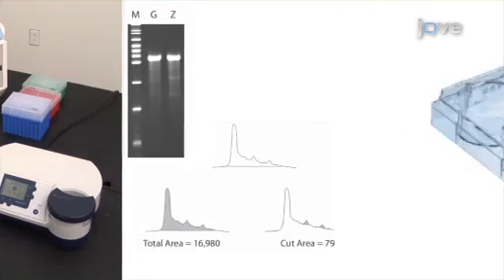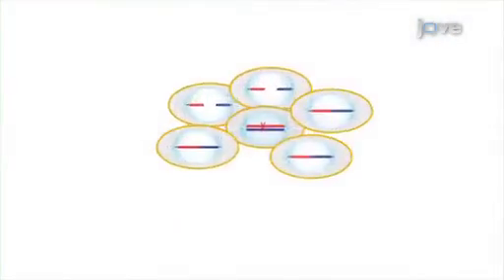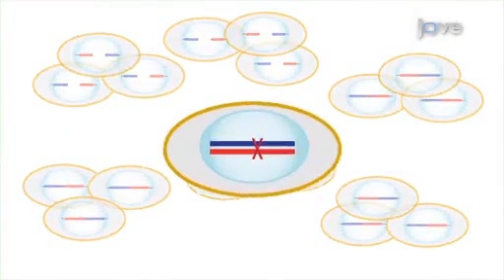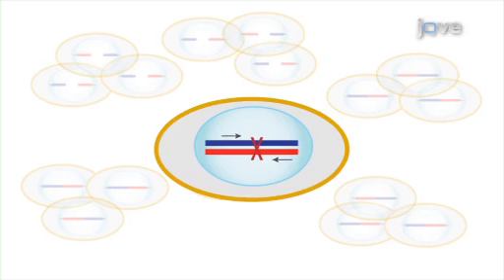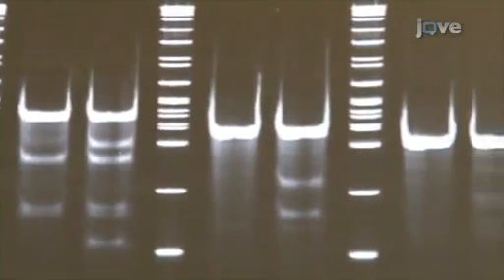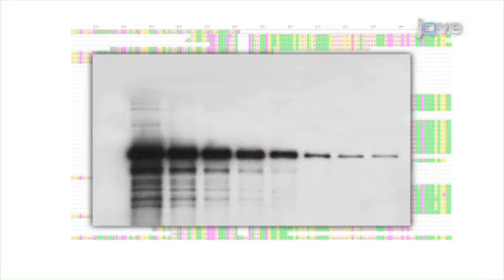target sites. For generating a knockout cell line, the cell type of interest is first treated with an active ZFN. Then this population is segregated to single cells, and finally these clonal populations are expanded for additional genotypic characterization. Clones with disruptive non-homologous end joining events at the target site may be studied further in the context of functional gene knockout. Ultimately, genetic characterization, including the Cel-1 assay and DNA sequencing, are necessary to confirm observed changes in cellular phenotype as a result of ZFN-mediated genetic modification.